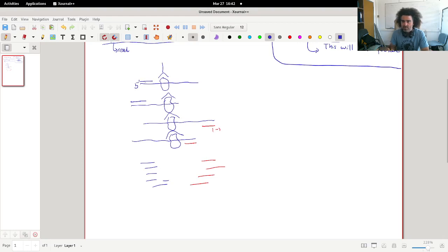Now if we map these reads back to the reference genome, so if this is, let's say, the location that the protein binds to, then aligning these reads we will get reads here, or we will get reads here, and we'll get reads here.